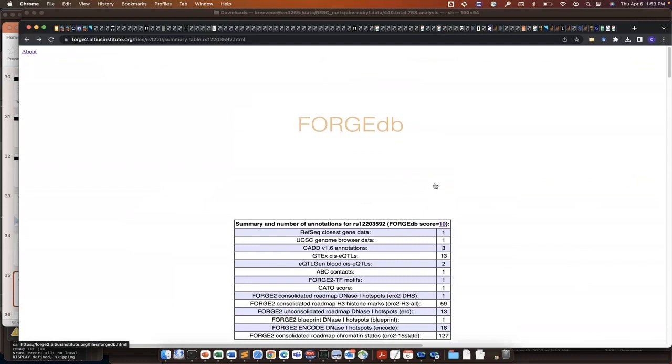We have a standalone version of FORGEdb that runs on all those SNPs as well because we work on location as well. So we can work on SNPs that don't have an RS number. You were talking about the virus. We found the HPV16 SNP in this specific region, but it's not human, so it's not possible to input here. Right, this is for human data. For non-human information, especially for viruses, you're mostly interested in protein structure.